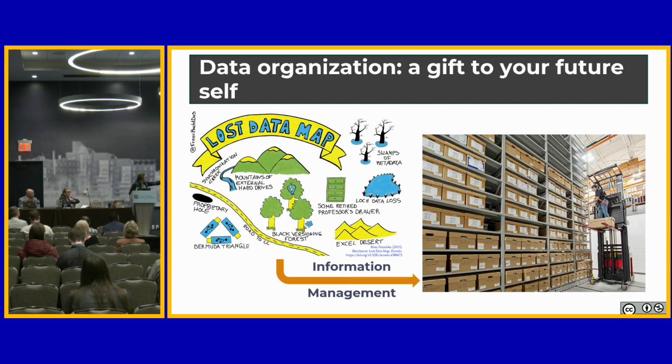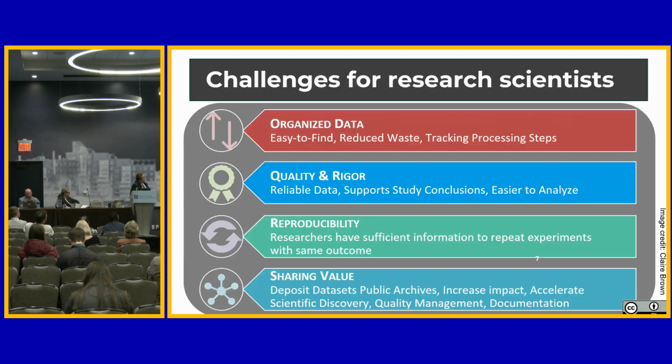And one thing that I want to point out in this image, which is obviously very different from what we are going to end up using for biological data, is that it's about boxes. Each one is separate, and there is the label. Without a label, they might be very organized, but I'm not going to find them. And if they're not in boxes, you could also think of a dump as a storage, but obviously it's not going to be very useful. So storage is one part, but organization and labeling is an essential part.